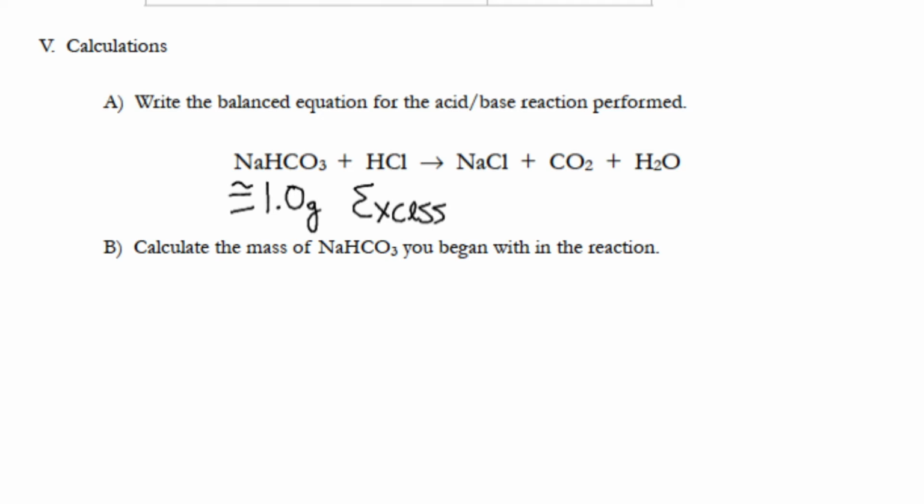It's not dangerous at all. If you spill, please just clean it up. You can touch it. Don't, but you can. It's fine. But guys, this is the trick. Do not get less than 1 gram of sodium bicarbonate. You can get more. You don't want 2 grams because it won't fit in the dish. But guys, if you get like 1.1, 1.2, that's fine.